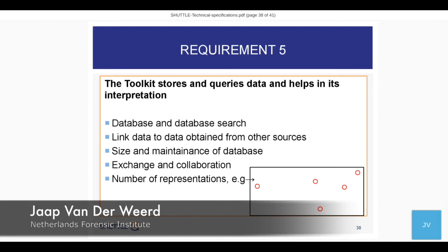We'll specify that it can be installed on different computers. So there's not a single installation to which we all should have access. We hope that will be the case in a couple of years, but for now, that's not possible. We will not get the technical opportunities to all access the same database. Forensic labs normally have quite a strict computer system, and it will not be possible to just access everything and upload your data to a central server somewhere in Europe. So we'll require local installations, but also the possibility to exchange.